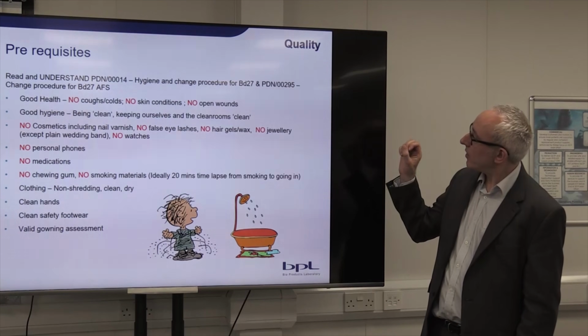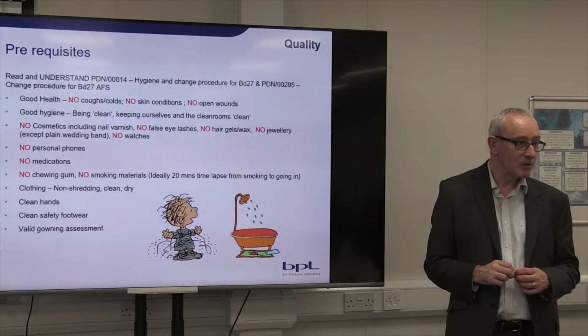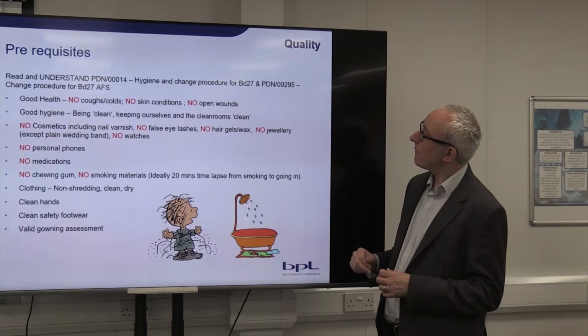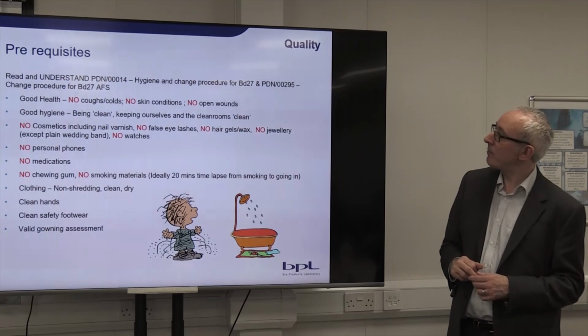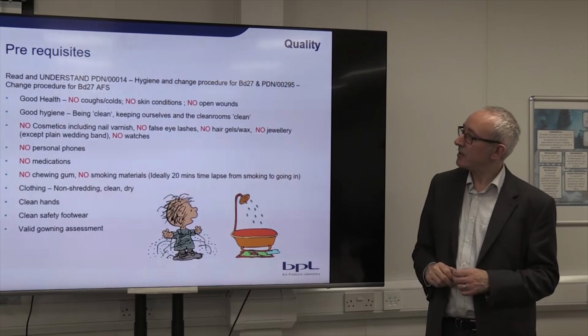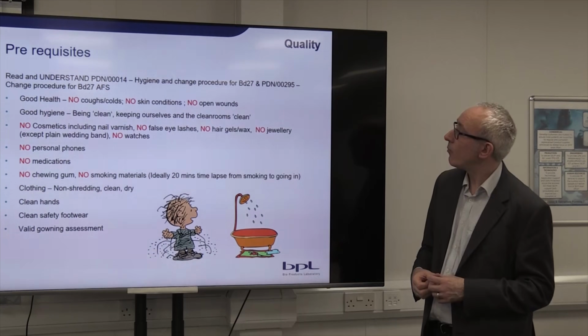Okay, so when you're going into a clean room, there are a number of important documents that need to be read. So there is PDN 14, which is about hygiene, and then there is PDN 295, which captures other elements of the change process.